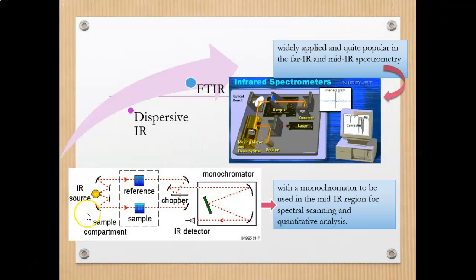Okay, when energy in the form of infrared is applied, it will cause vibration between the atoms of the molecule. When the applied infrared frequency matches the natural frequency of the vibration, absorption of IR radiation will take place and a peak is observed.